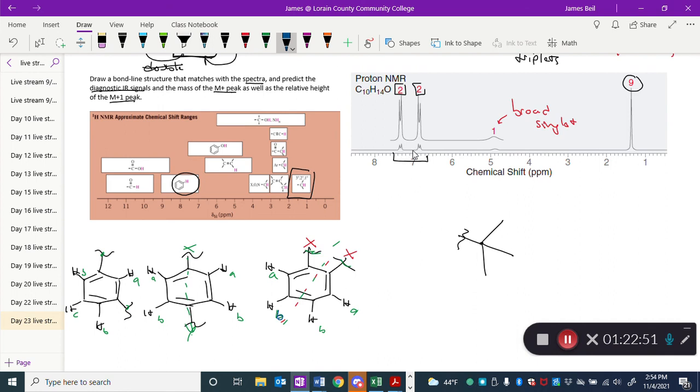So this kind of looks like a doublet of doublets, but then I'd still need to see a signal for HA somewhere, and it wouldn't be accounted for if this signal were only for HB. So that's a really good point, and that really does pretty much rule out this as a possibility. And we already ruled this one out as a possibility given the number of signals. So this definitely seems to be the puzzle piece we have, because in this situation, in terms of the splitting, which I didn't really even get to before Austin mentioned it, but that was an excellent point.